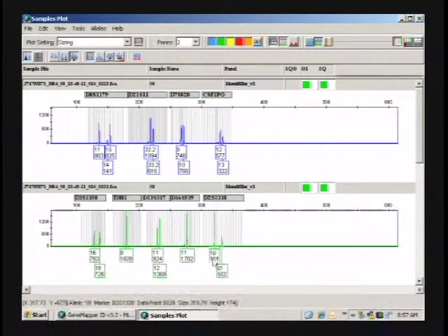You'll see some peak heights, but you'll see your imbalances. Once again, you have to check the original data, but if you had an imbalance before, you're going to have the imbalance after, especially if you have a big imbalance like this. If it was just slightly off, it may just change due to injection. But when you have a large imbalance, it usually tends to stay like that.